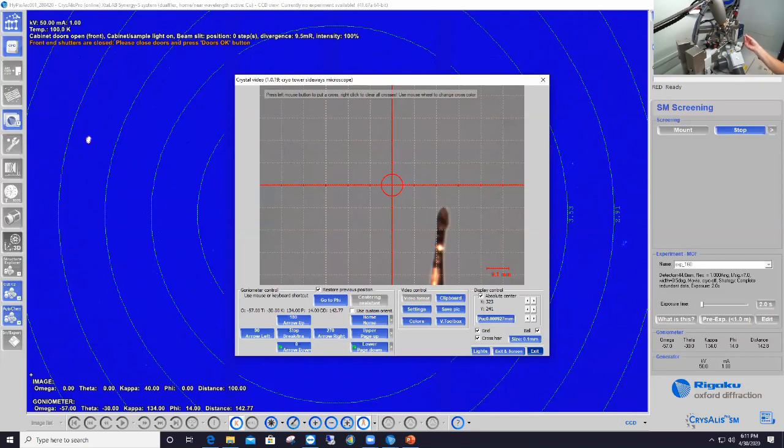You might not see it properly on the video display, but that tool is hollow. And I can set the tool onto pins that stick out, so to speak, stick out of the goniometer head. So I've got one pin here and another set of pin 90 degrees away from the first one. So one pin here and one pin there. There's also a 90-degree angle between them. It amounts to having an x-axis and a y-axis on the goniometer head.